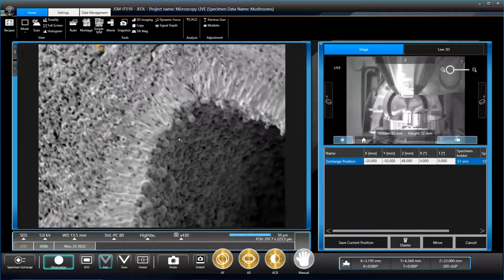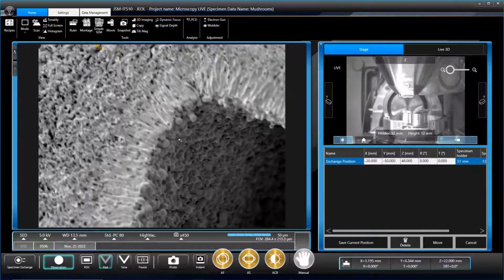I imagine that's just a more protected area. Interesting fact about spores is that they travel, I think, 10,000 times faster than a space rocket after launch. Wow. Pretty damn fast. As planetary scientists, that's directly relevant to our interest.